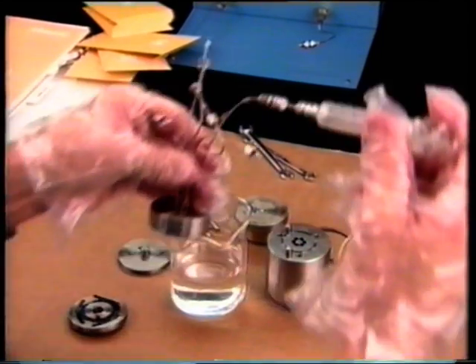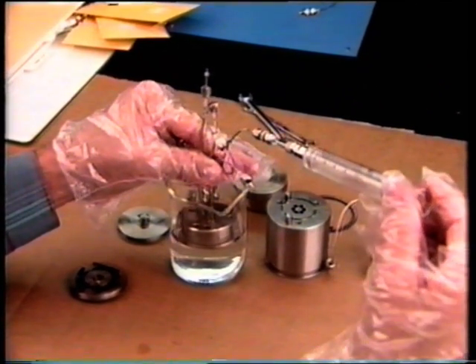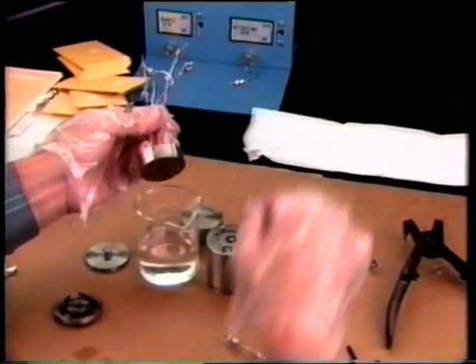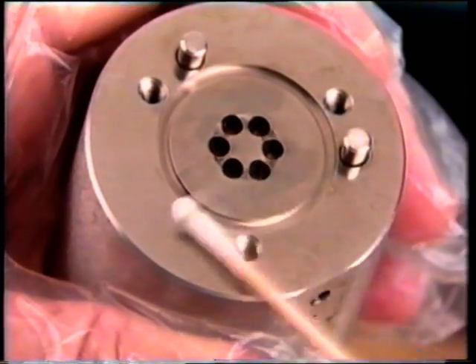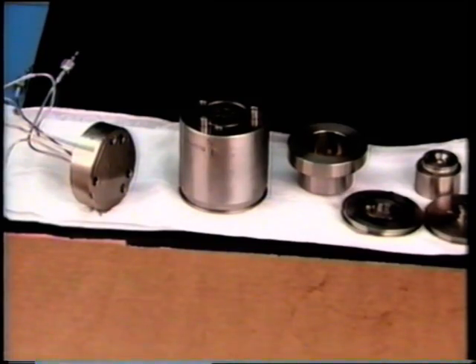Use a syringe to force cleaning fluid back and forth through each of the tubes of the valve cap while keeping the cap submerged in a cleaning solution. Rinse and shake out the tubes. Then let the cap air dry before reassembly. Wipe off grease and contamination from all other valve parts and wash them in the cleaning solution. Allow the parts to air dry.